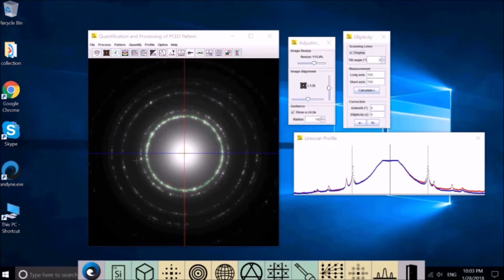After careful alignment, we can see the two profiles: the blue line is slightly outside compared to the red peak. The red peak is slightly inward and the blue peak outward.